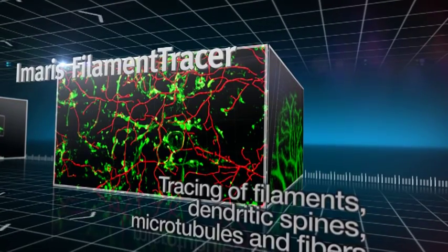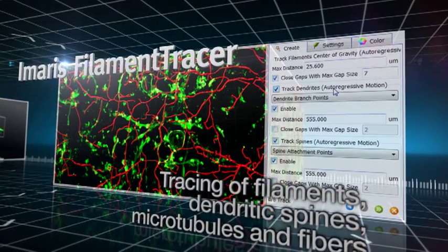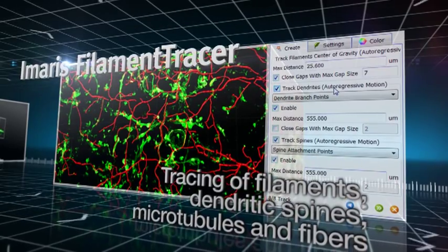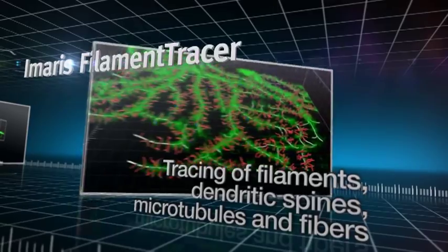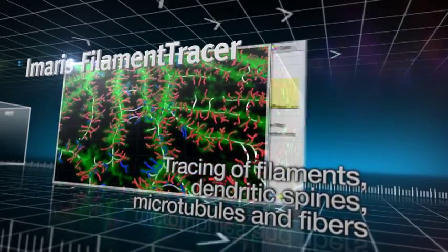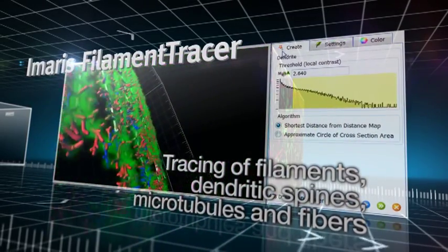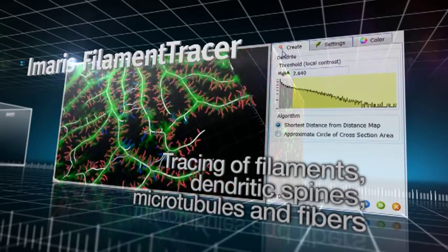A key module of Imaris, Filament Tracer, is the most advanced software solution for the automatic detection of filamentous structures in 2, 3 and 4D. With Filament Tracer, you can visualize and measure blood vessels, neurons, dendritic trees, spines and microtubules.